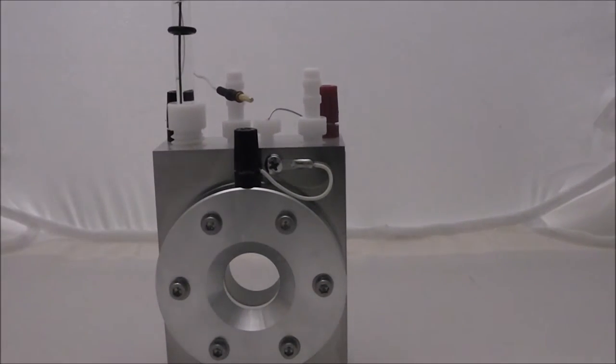It's designed to go with the SIMPS systems from Zahna. Zahna is a real leader in photo-electrochemical type experiments.